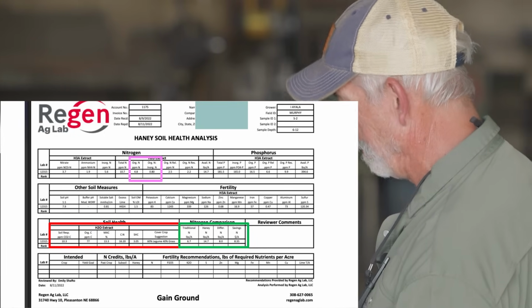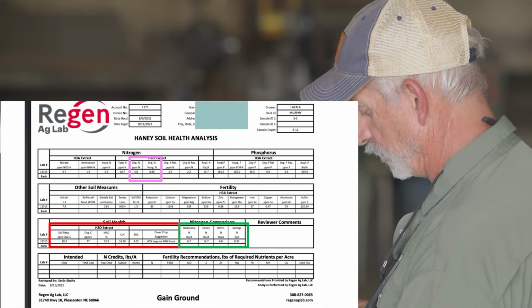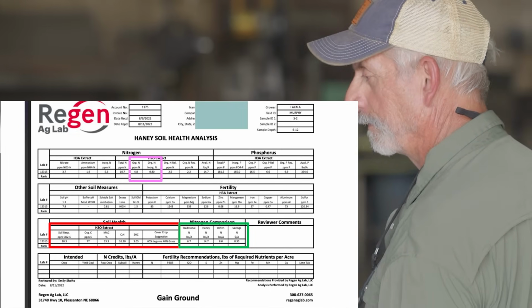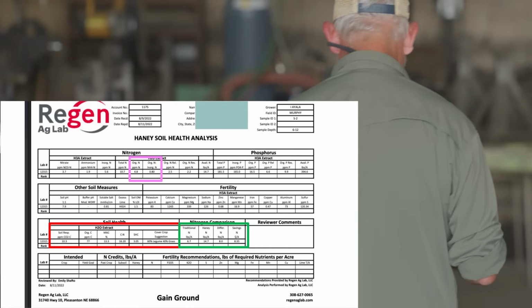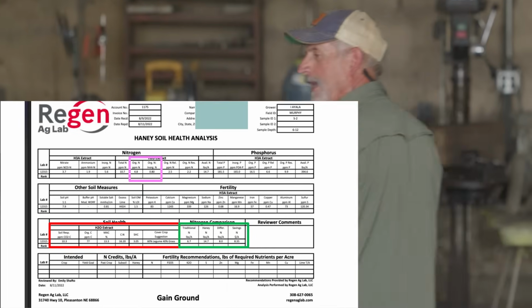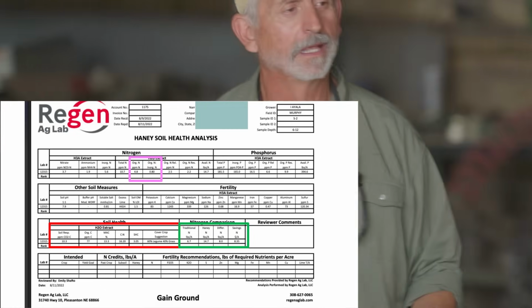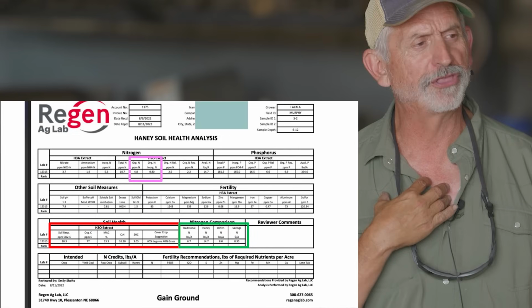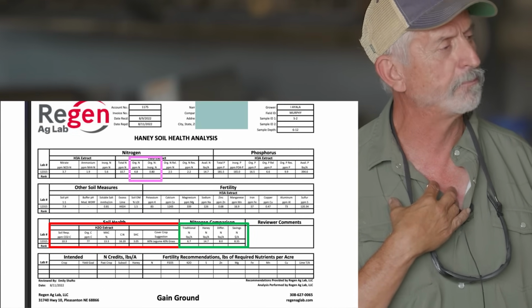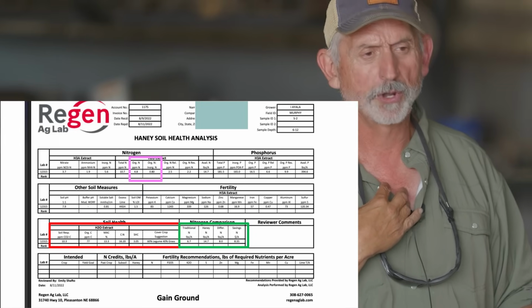What did I say in my guide I want at the minimum? Look at that. It's respiration. How do the strawberries look? What's the respiration? Stephanie, what's the number? 10.3. Those are strawberries we buy at your grocery store. How healthy do you think it is when the soil has a respiration of 10.3? Look at the water-soluble carbon.